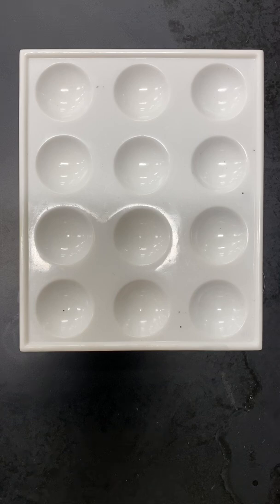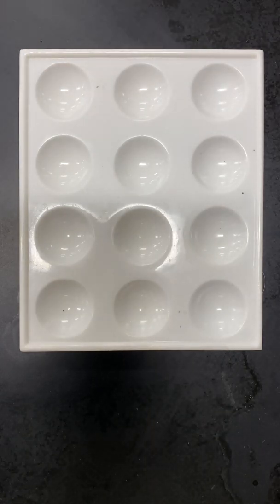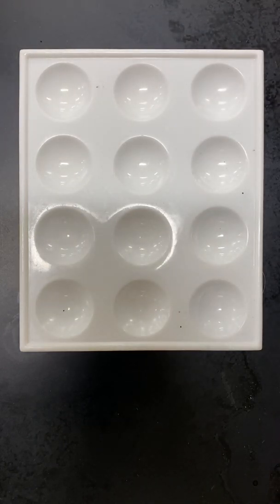So the first thing I'm going to have to do is add 1 drop of enzyme into each of the 12 spots. So I'm going to do that right now.